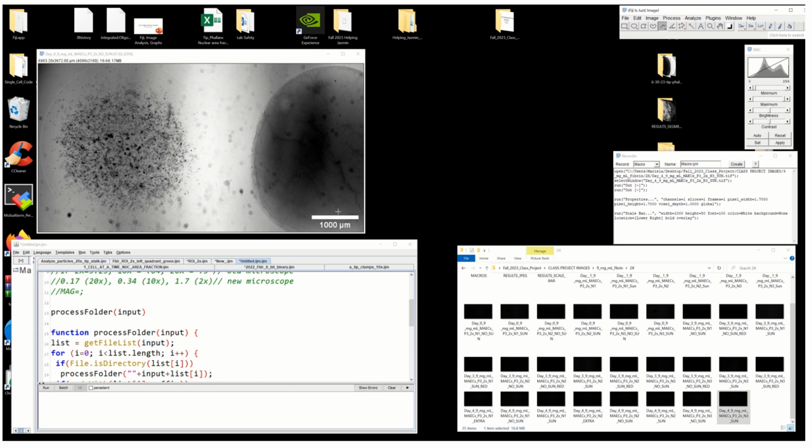Anytime you present research, you have to have your scale bar in your presentation images. But whenever you do analysis, you do not want a scale bar there, because it will actually be counted as data. Fiji thinks that this white bar is cells, so don't do that.